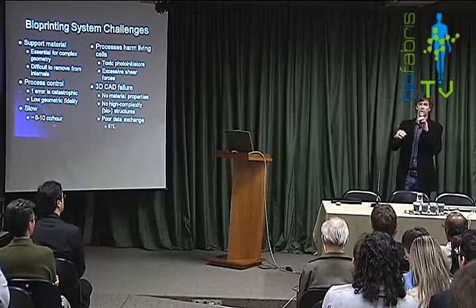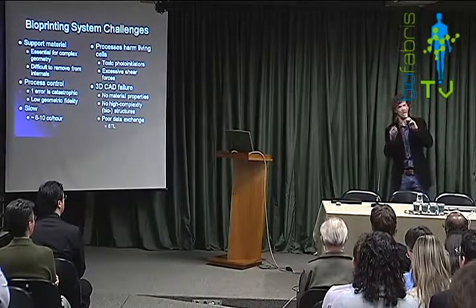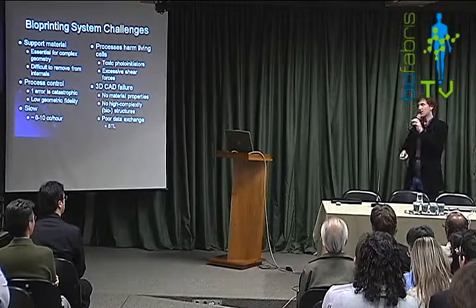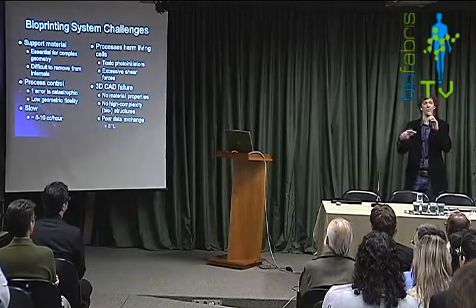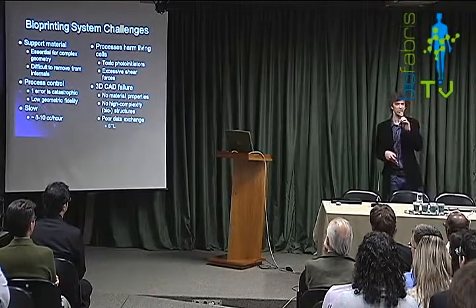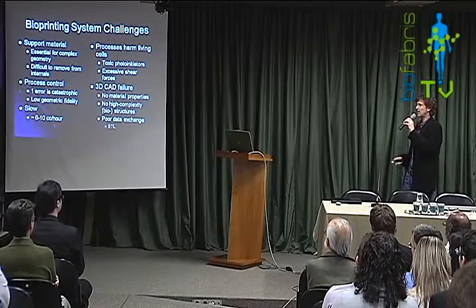But if you really want to do a vascular tree, you've got branchings and so on that you can't lay down in any nice way, so they'll have to be supported. And I know there are ideas out there for this, but this is often a challenge. Any really complex geometry needs a support material that you then have to remove afterward, and it can be quite difficult to remove it from any internal cavities without causing harm to the object you're producing.